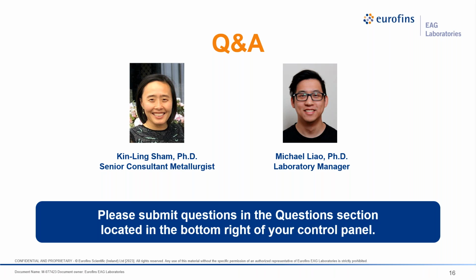It depends on the material that you're testing, the manufacturing conditions, and also the surface finish of your sample. In corrosion testing, it's dependent on your sample.